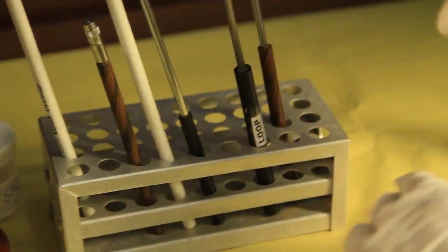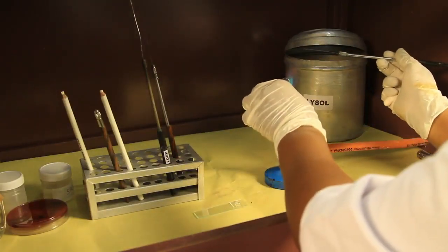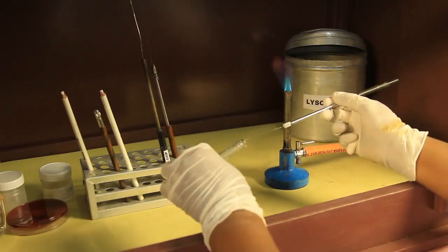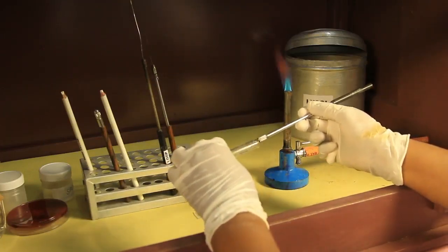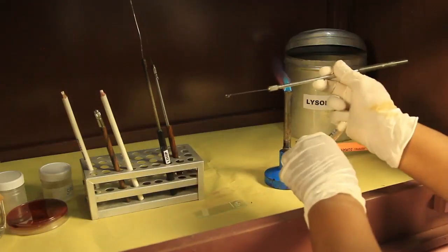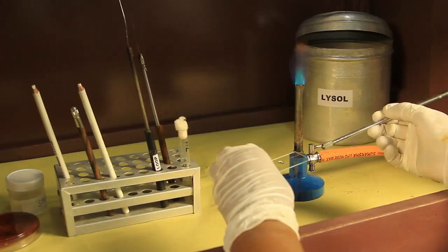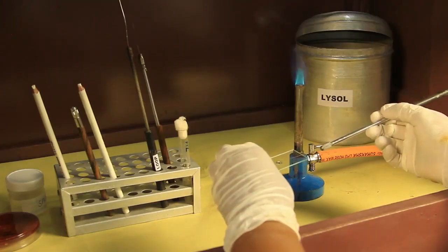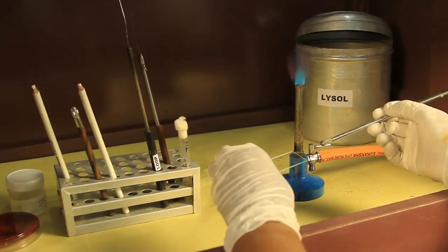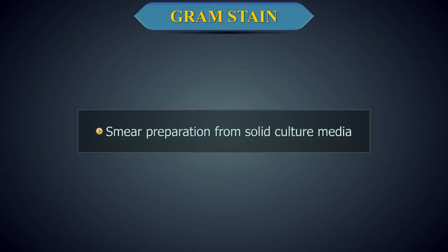Smear preparation from broth culture. Take a tube of broth culture and remove its cotton plug. Flame the mouth of the tube and pick a loopful of broth culture with a sterile inoculating loop. Replace the cotton plug and put the tube aside. Spread the loopful of the culture onto the middle of a labeled slide and let it air dry. Sterilize the inoculating loop.